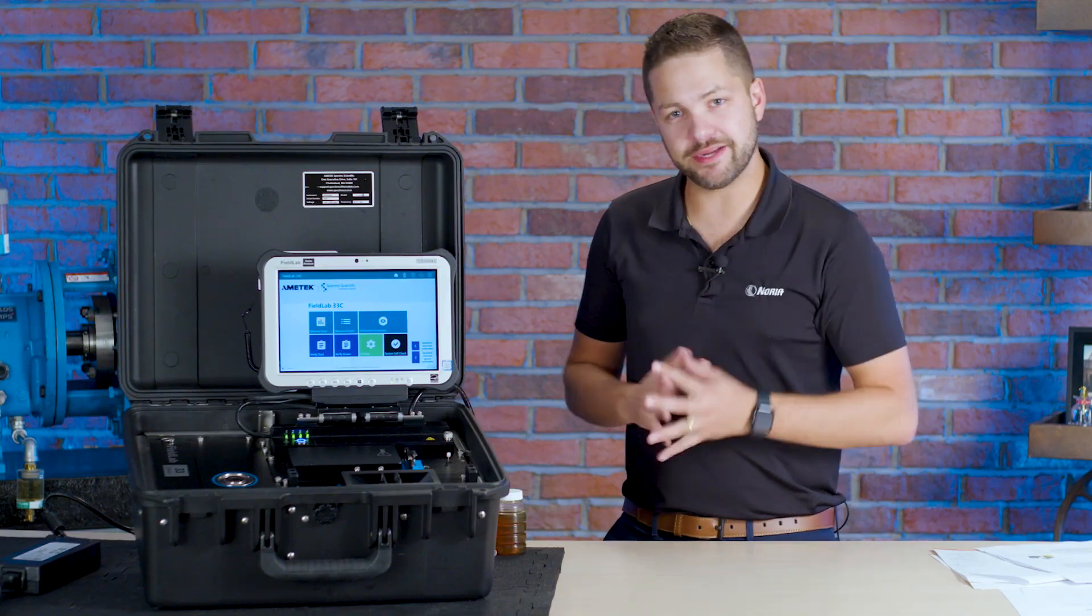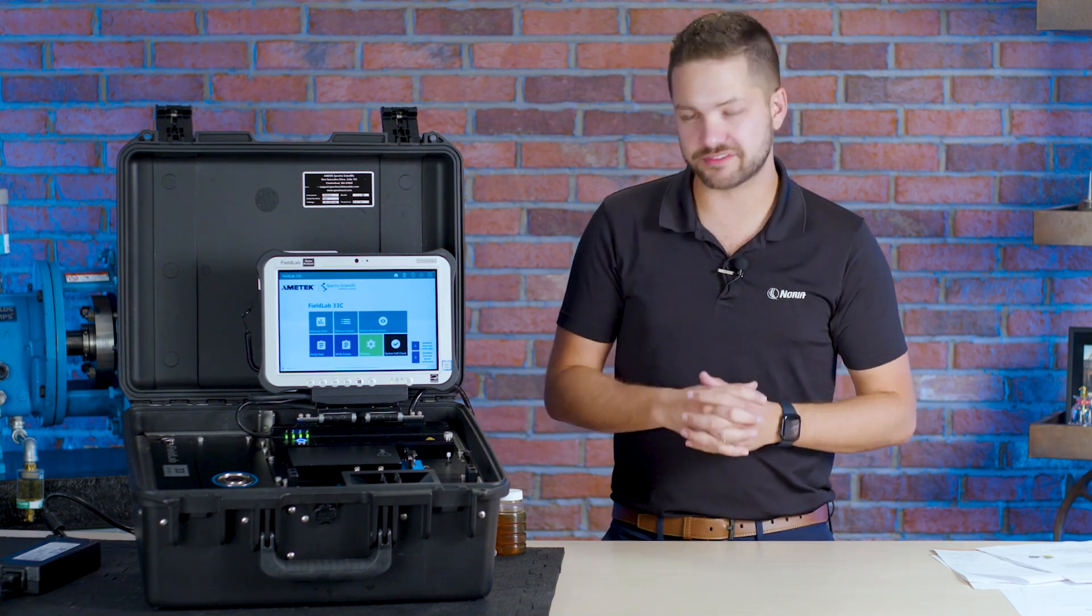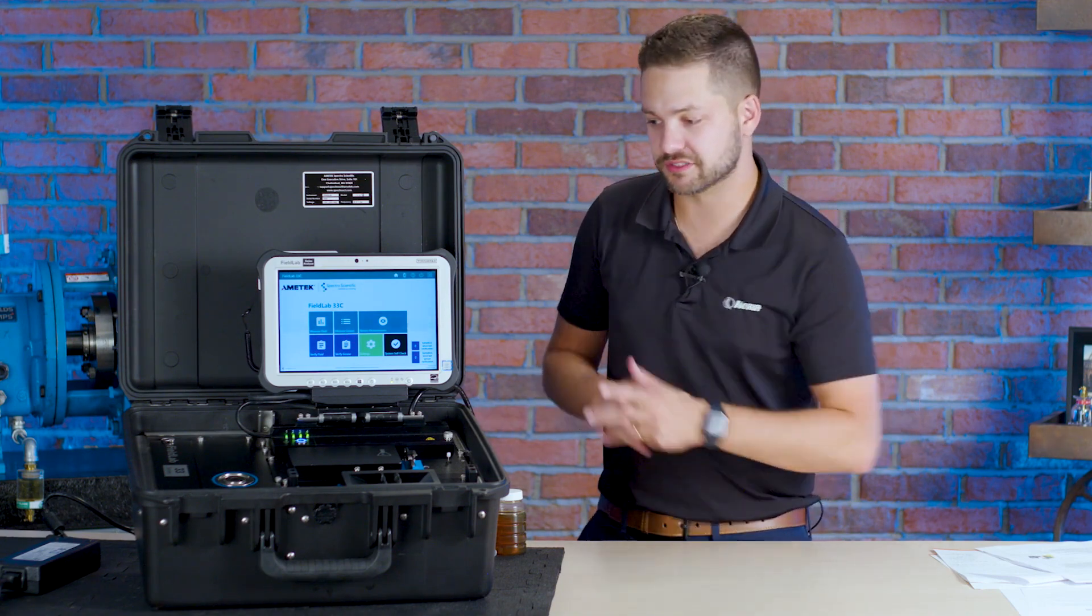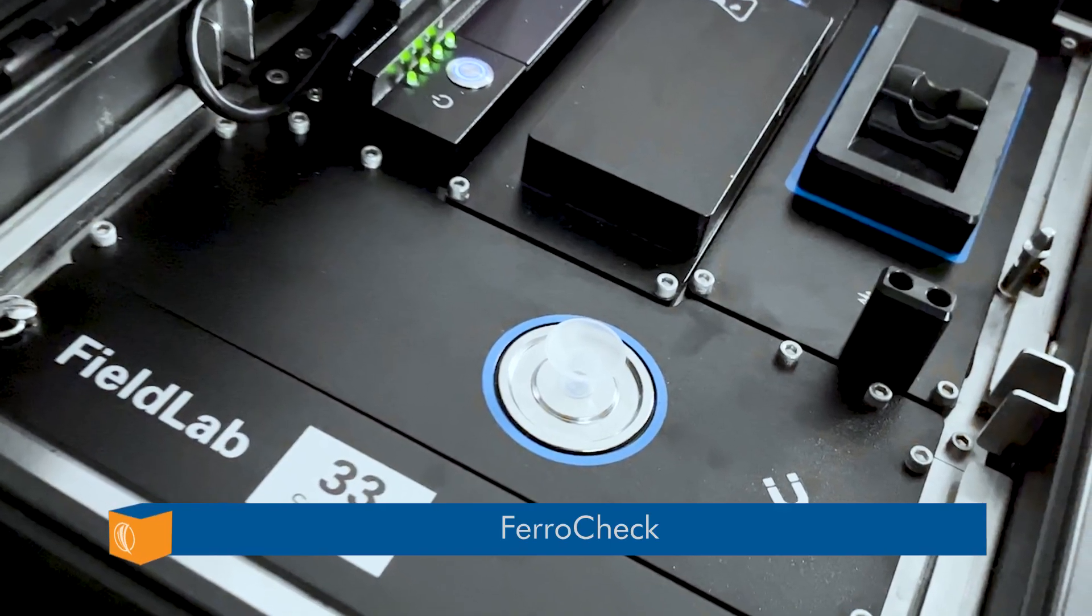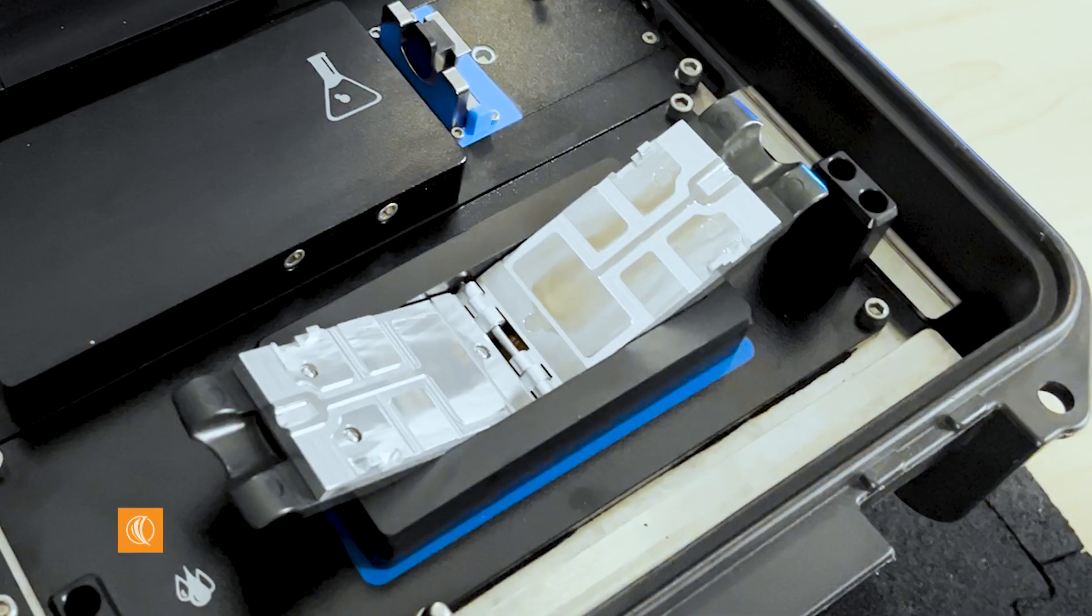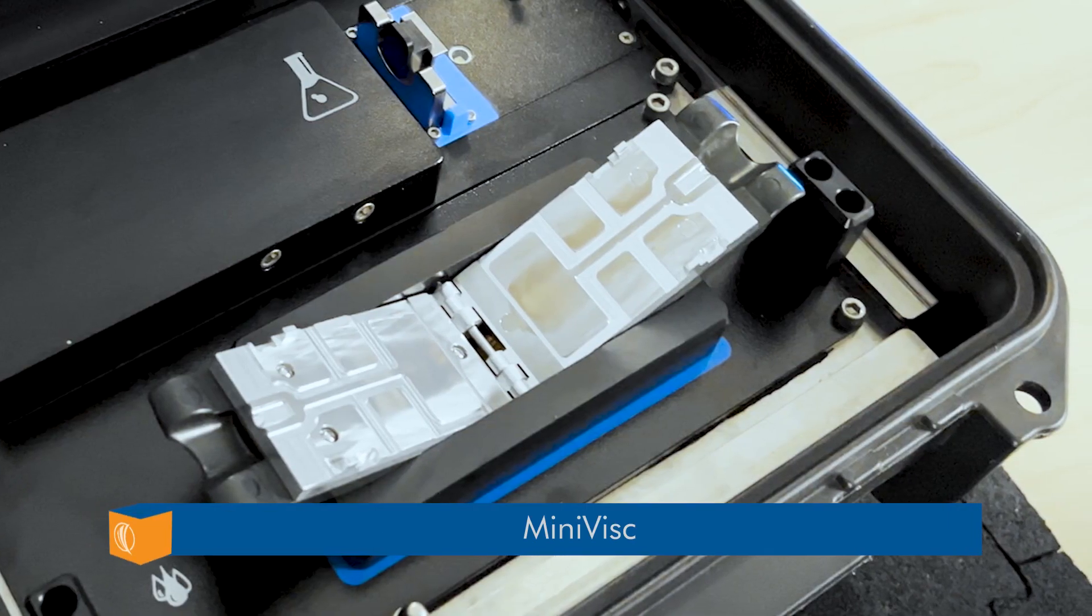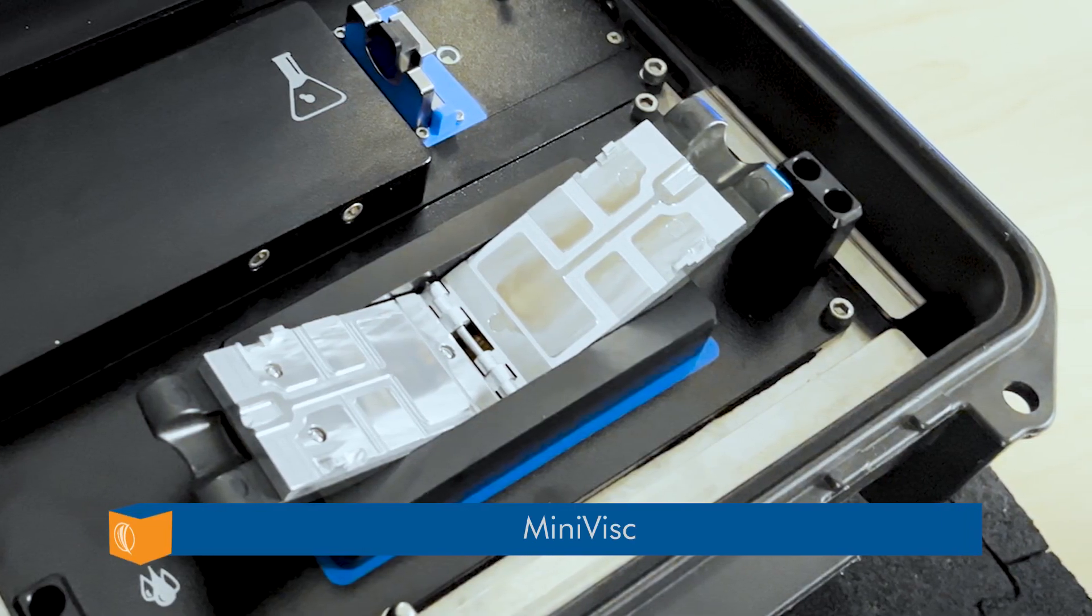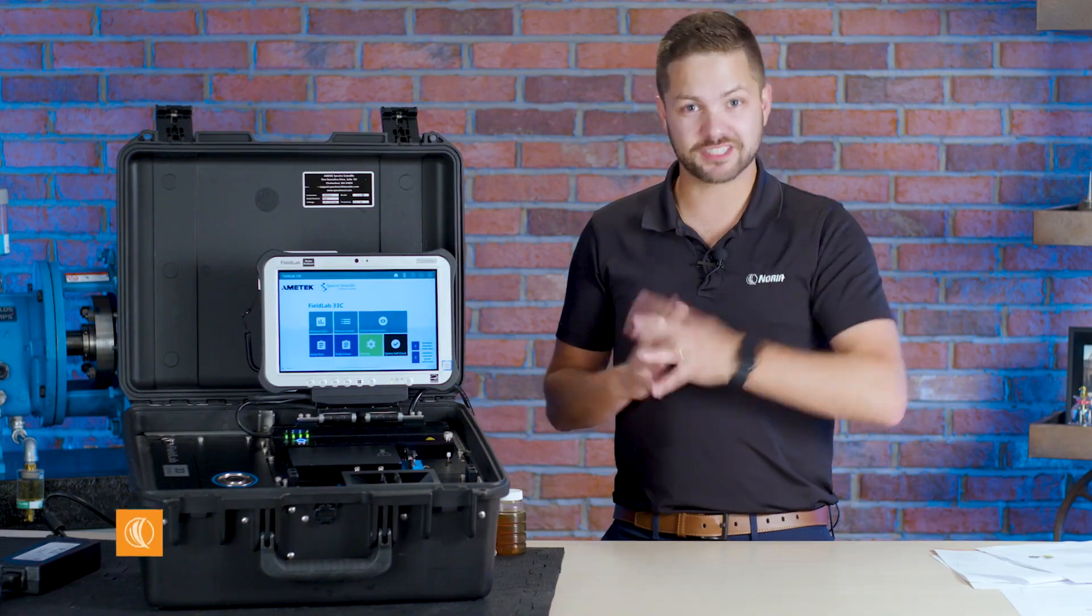Now there's three main instruments here, three comprehensive testing opportunities. One is the ferrachick. That's going to be about wear debris. We have the Minivisc which is focusing on the most important fluid property which is viscosity.